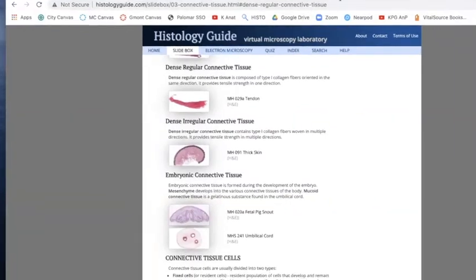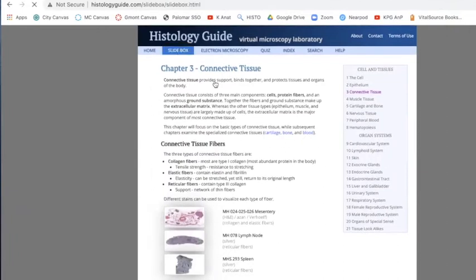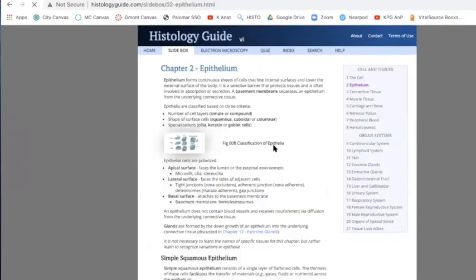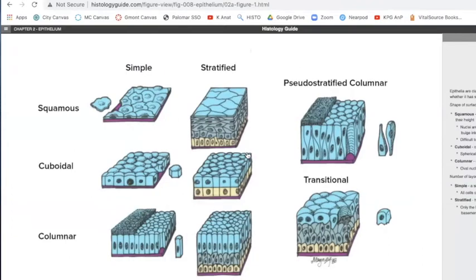Okay, so just to go back to that lab, because I do have a video on it, for the epithelial stuff. First off, there's this nice cartoon version where it's very easy to identify these epithelial tissues. But in real-life histology, all you might see is the nuclei of these, and you're going to have to really determine, all right, these cells are pretty close together.